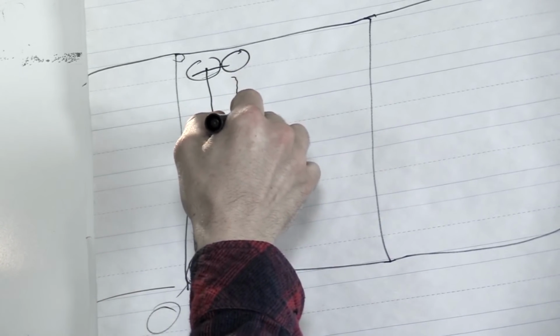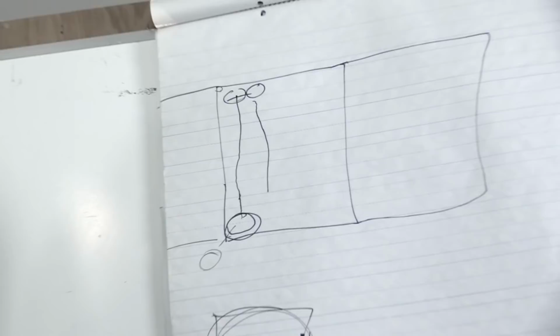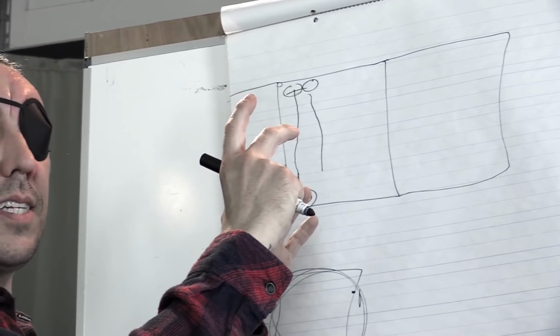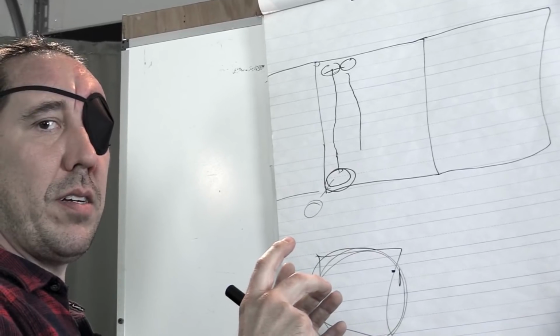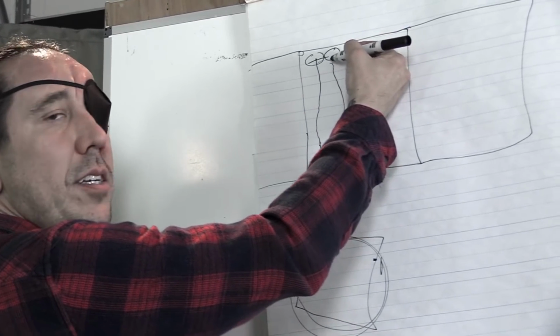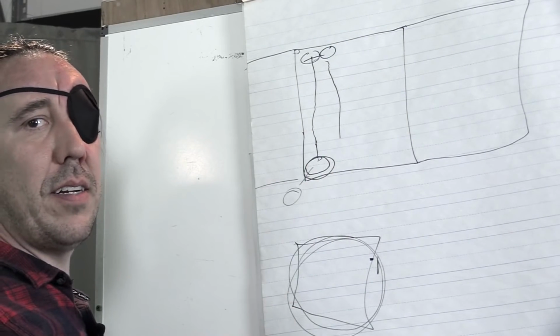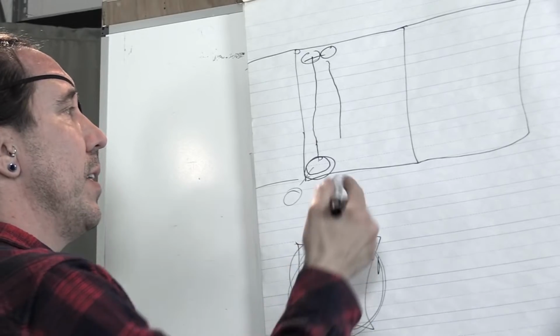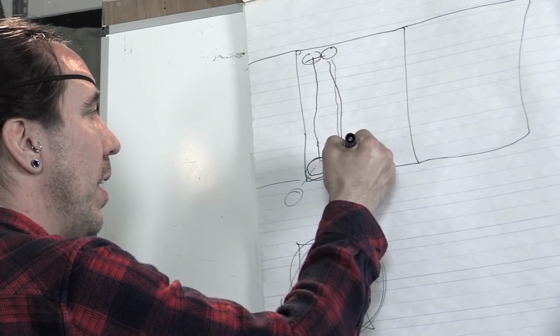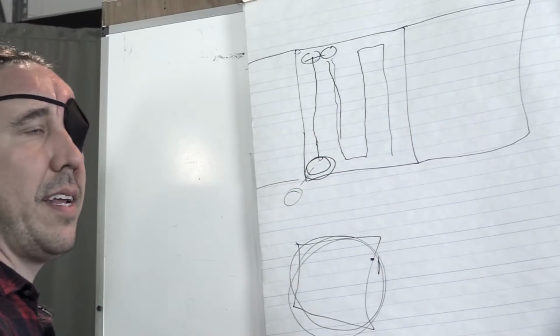And then scan, scan, scan, scan, scan. You're going to just slowly move down, as slow as you need to. If you need to look, stop, move, look, stop, move, look, stop, you can do that. You'll get to the point where you can really just slowly move and look for the shapes of nematodes and the movement. So go down like that, move over. That's how I do a nematode scan.